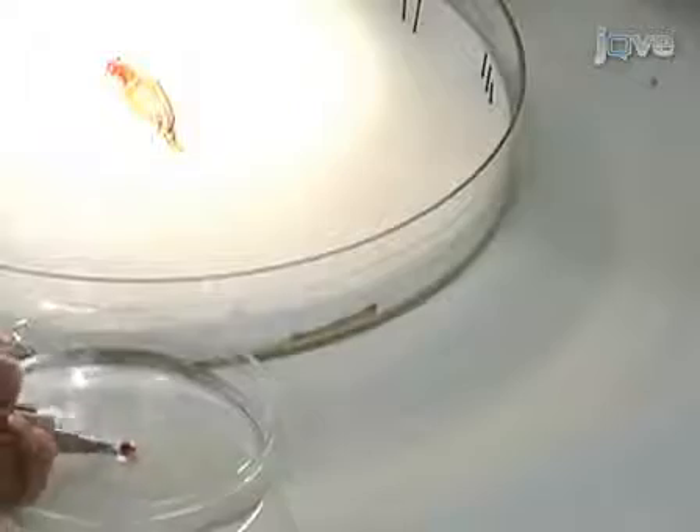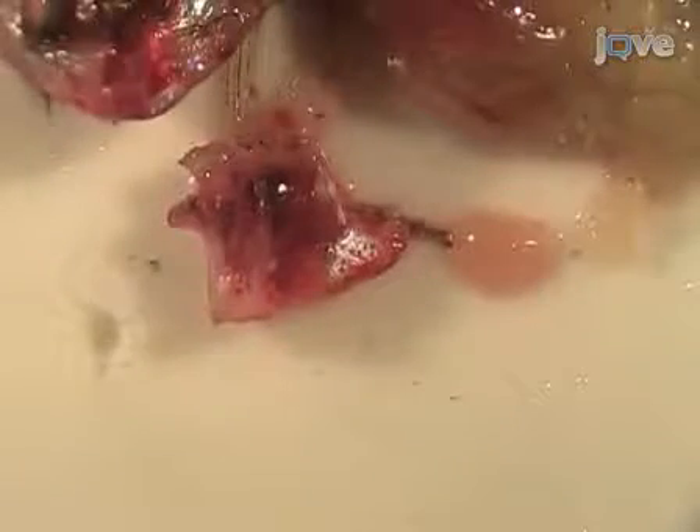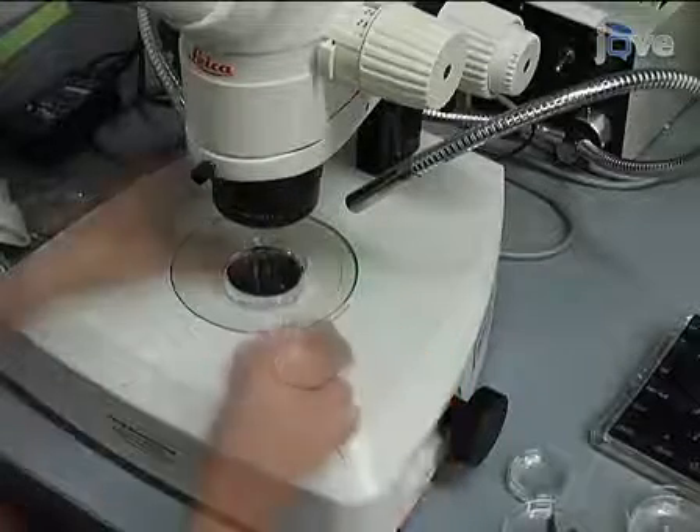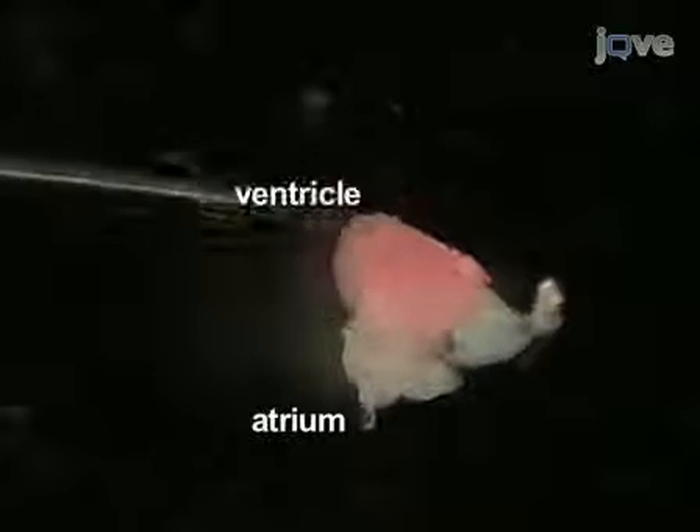Next, dissect the heart from the fish. The heart is located posterior and ventral to the gill. Begin by cutting out the heart and all of the surrounding tissue and placing it in PBS. Under the microscope, gently dissect away the tissue surrounding the heart, being careful not to damage the delicate atrium. Place the dissected heart into Ringer solution and put it under the microscope to observe the heartbeat. Identify the atrium, ventricle, and bulbus arteriosus.